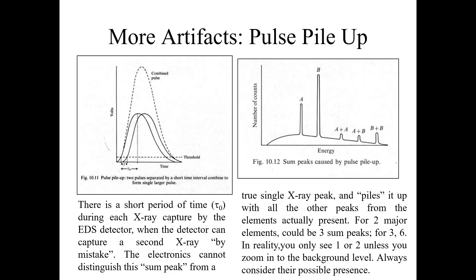There is a more significant artifact: pulse pile-up. There is a short period of dead time noted during each X-ray captured by the EDS detector, when the detector can capture a second X-ray by mistake. The electronics cannot distinguish this sum peak from the true signal X-ray peak, and it files up with all other peaks from elements actually present. For two major elements there could be sum peaks, but in reality you only see one or two unless you zoom to the background level. Always consider their possible presence.